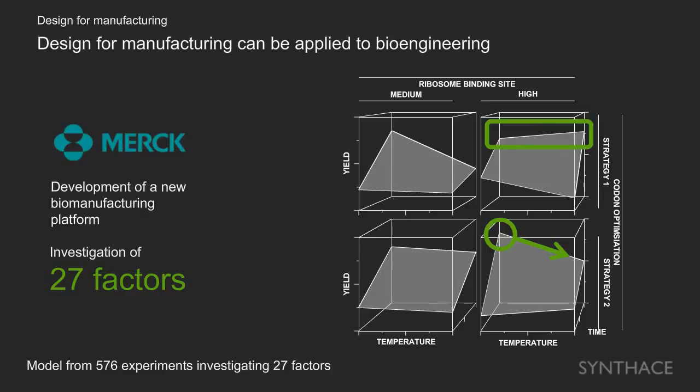This ability to do model building is fundamental to ultimately being able to do design for manufacturing and to be able to transfer the results of working with a biological system from one environment to another. It's the exact same principle that lets you transfer a working practice like construct assembly or a biomanufacturing process like making an antibody-conjugated drug.